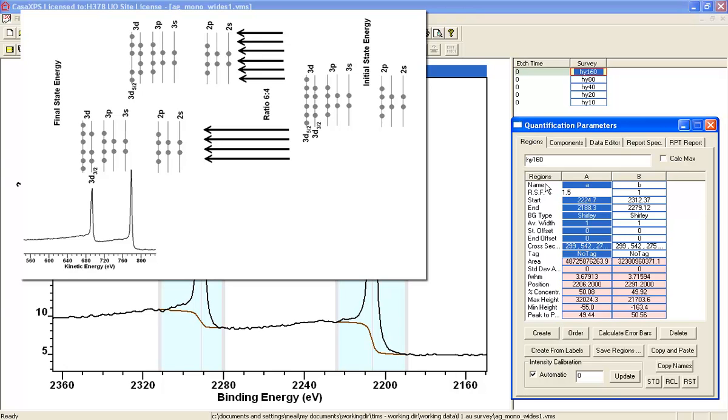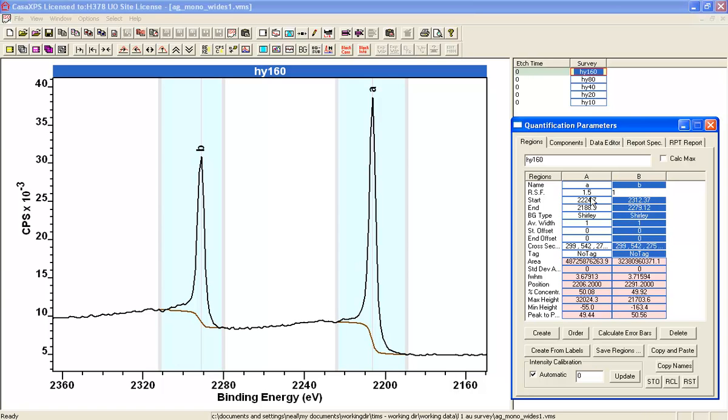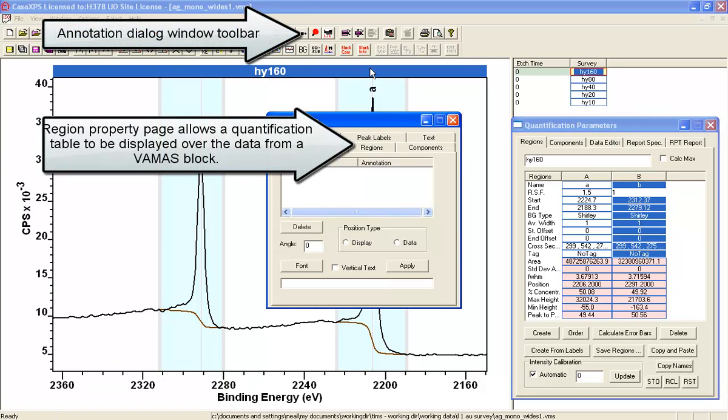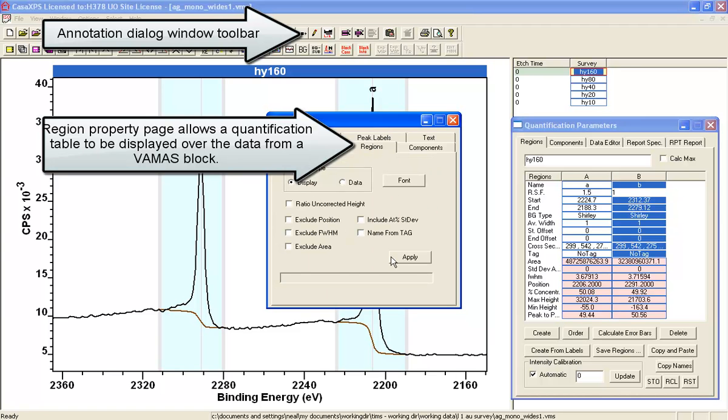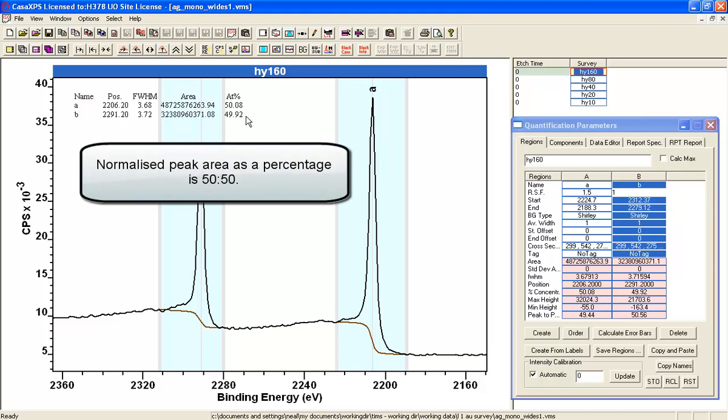And the ratio of these peaks should be 6 to 4 in favor of A. And that's exactly what, if I scale the intensities by a relative sensitivity relative to B of 1.5, then the percent concentration, which I can also see here, if I put up a quantification table over the data, you can see that when I scale according to the physical processes that I understand associated with these peaks, I do indeed get the same amount.